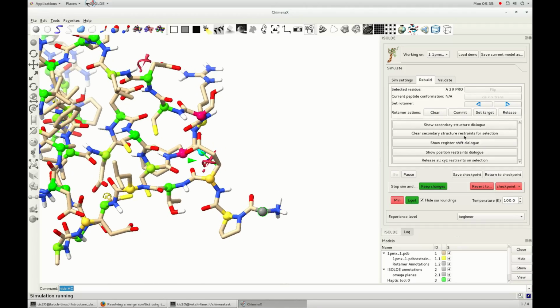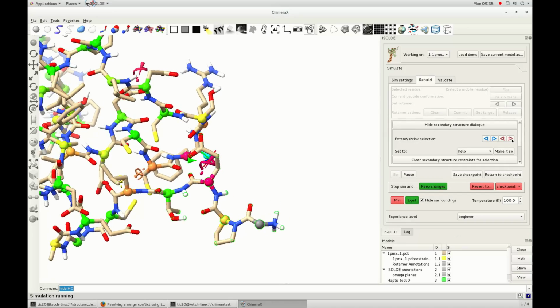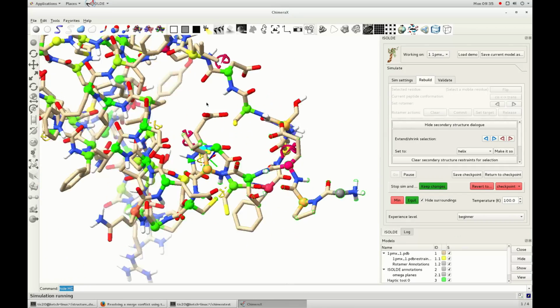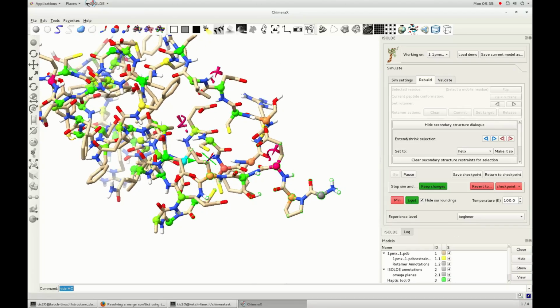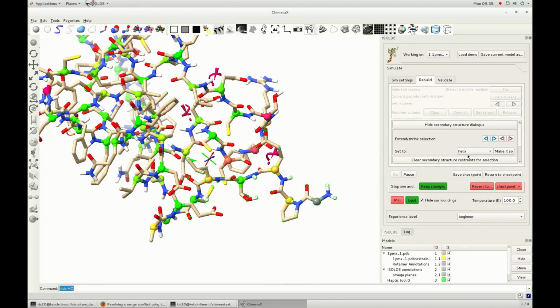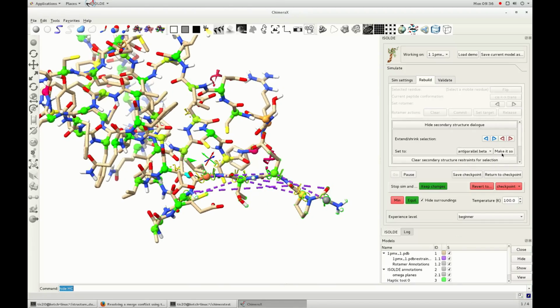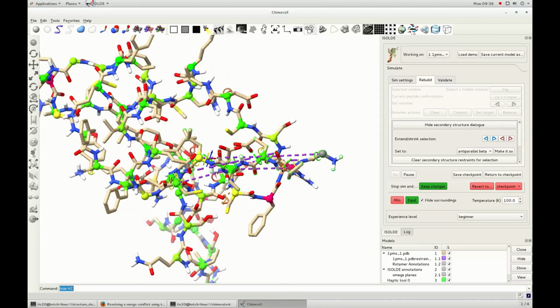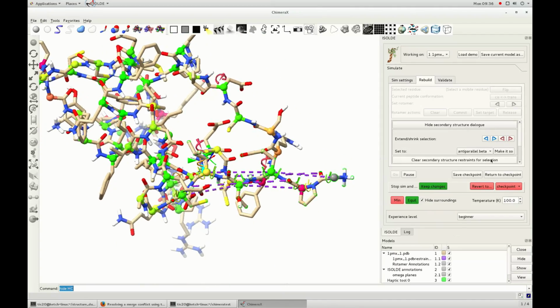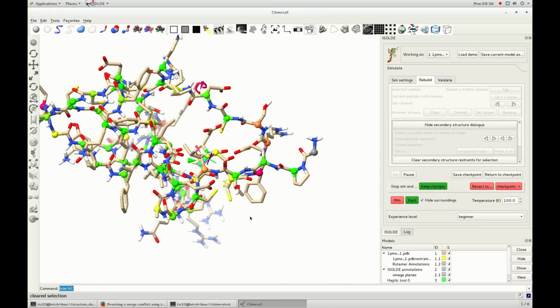Now, on to secondary structure restraints. These combine dihedral restraints with atom-to-atom distance restraints to force the peptide backbone towards defined conformations, parallel or antiparallel beta strands or alpha helices. These are soft enough to still allow reasonable flexibility, but generally do a good job of attaining the desired conformation even when it's a very long way from the starting conformation. Like, say, if I wanted to turn this entire IGF-1 molecule into an alpha helix.